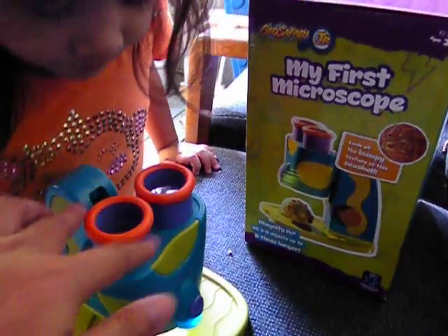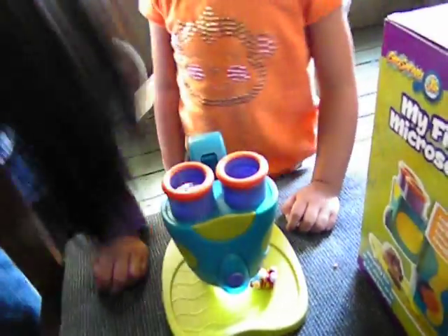Okay, let me see. Look in the eyepiece and let me see. It has two big eyepieces so it's easier for smaller kids to look into. Oh, I can see! Can you see it? Yeah.